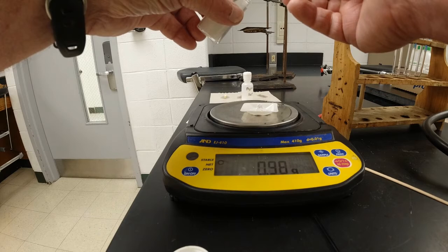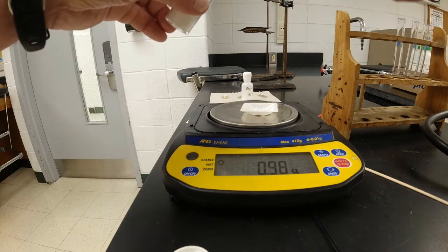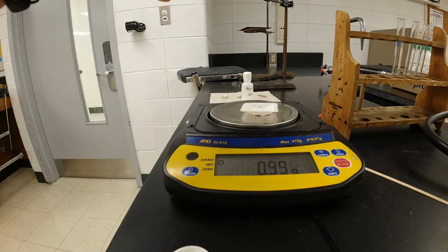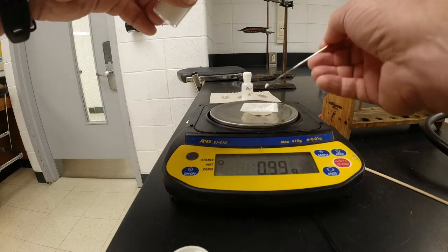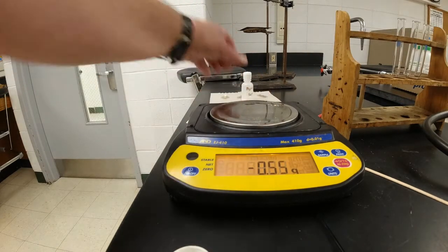Almost there. All right, there's 1 gram of the calcium sulfate.